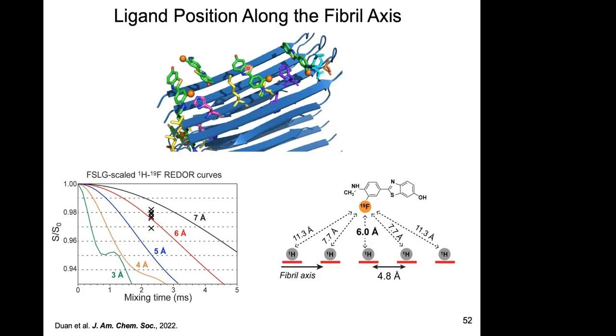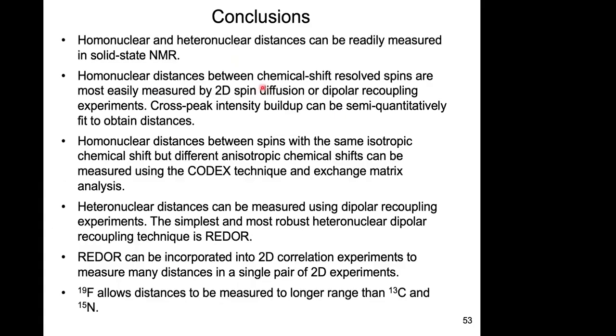We looked at the stoichiometry of the binding closely. It's something like 1 small molecule to 5 A beta. That's overall binding 20% stoichiometry. But out of that 20%, half is relatively tightly bound, this rigid limit CSA, and the other half is a little bit loosely bound. We're trying to explain just how saturated the beta sheet surface is by this molecule. So this gives us an idea that you can have a molecule that sits on one beta strand and blocks the next 2 chains.